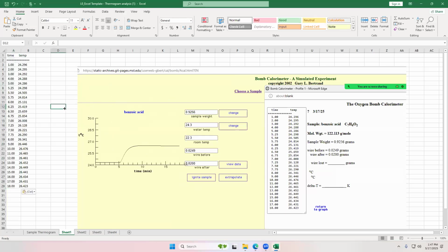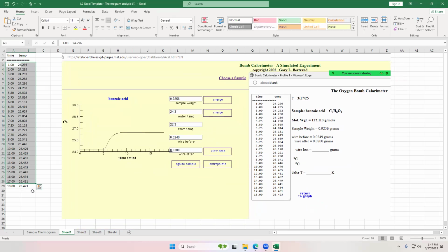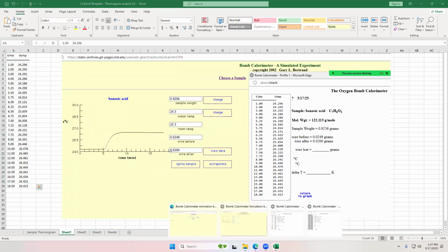Yeah, I got temperature versus time. Okay. So I have a screenshot and I have a table that should agree with what I have in the screenshot. Okay, still with me? Are we on the same one that we already made? You put your results in sheet 1.